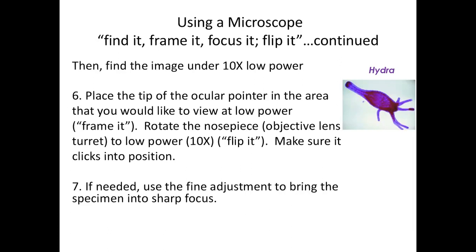Even on the 4 or 10X, you're pretty close to these guys. And if you use that coarse adjustment knob, you can very easily just rotate it so that it goes right into the objective lens and cracks your slide and damages the lens.